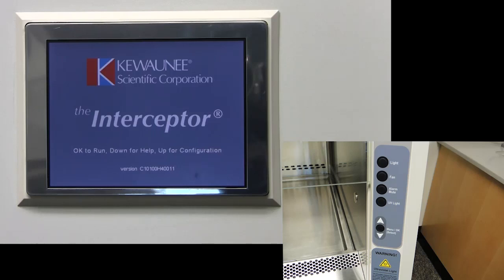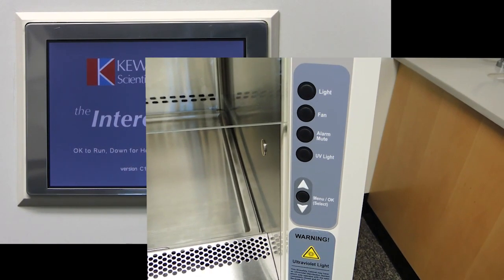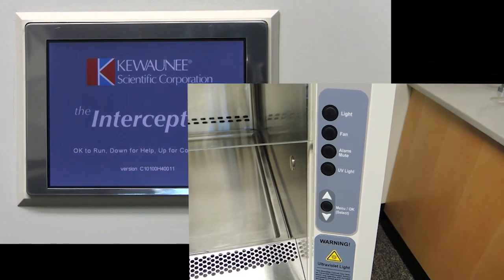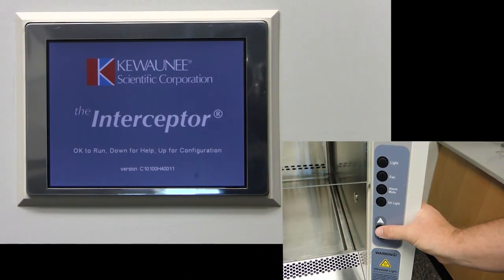When you initially plug in the BSC, you will see the Interceptor startup screen. After the cabinet has been in operation, you can return to the screen by holding the menu slash OK button for 5 seconds. The buttons on the right help you to navigate these screens. To go to the main run screen, press the menu slash OK button.